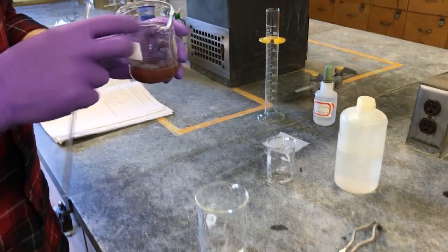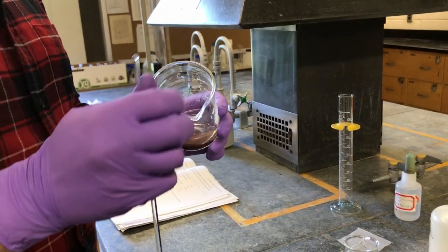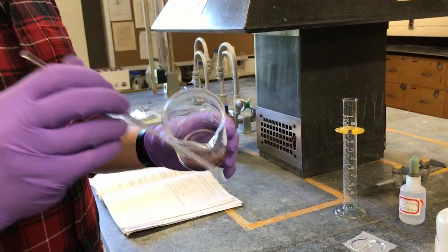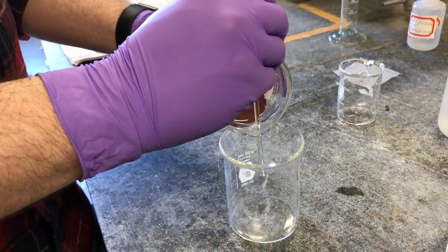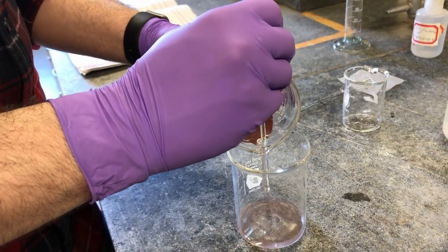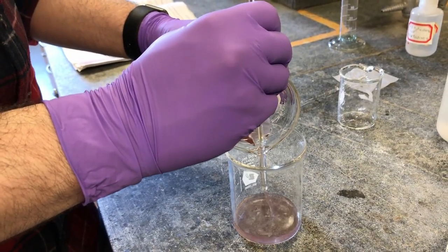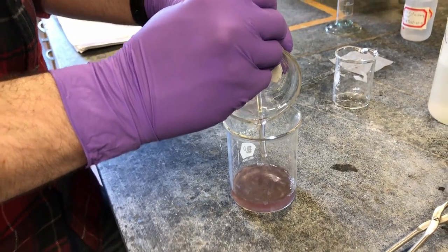Okay. So now that we have all of the copper chunks back into this flask, we're going to decant off the supernatant liquid, which would be our zinc chloride. And we're just going to carefully decant all the liquid while keeping the copper chunks, the copper solid, in this beaker. That's pretty easy.